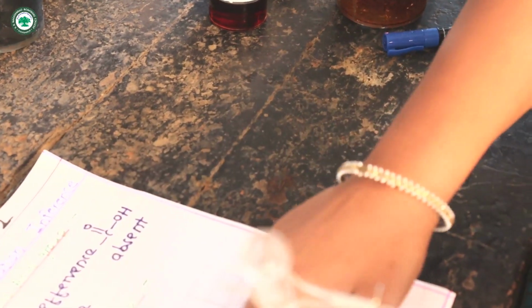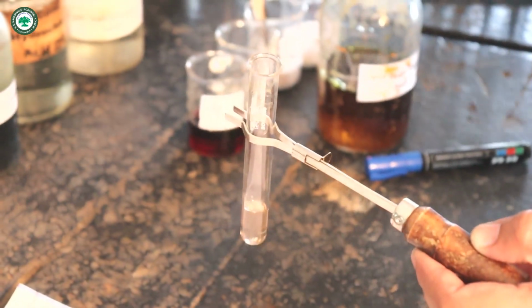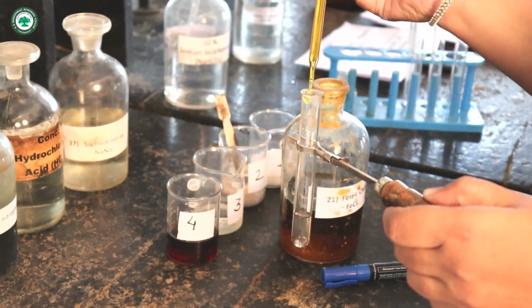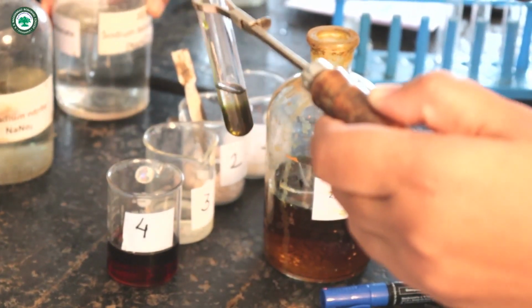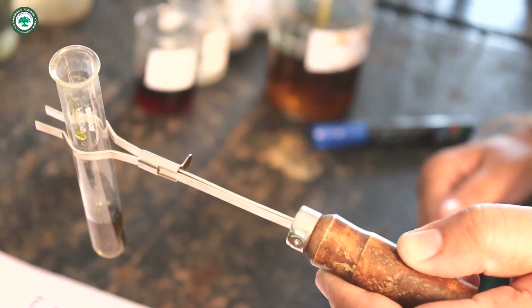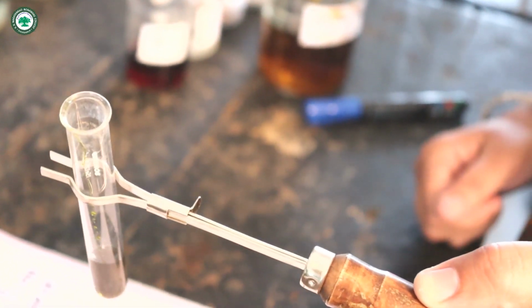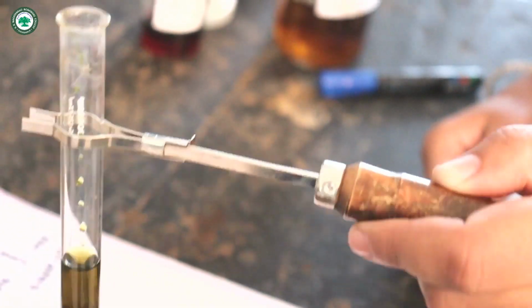Then add neutral FeCl3 solution. Then green color is observed. Therefore, phenolic OH group is present in compound second.